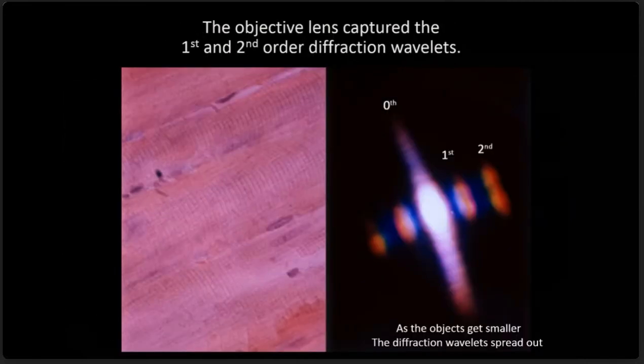So here is a picture of a striated muscle cell. This is some conventional muscle. It's probably taken with a 40x lens, it looks like. And you can see the striations. And these striations come closer and farther apart as the muscle contracts. They're kind of like an accordion in a way.